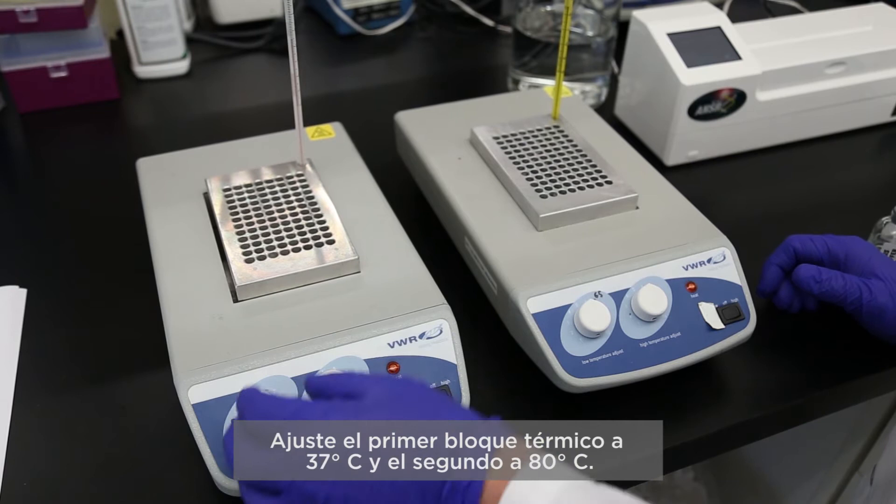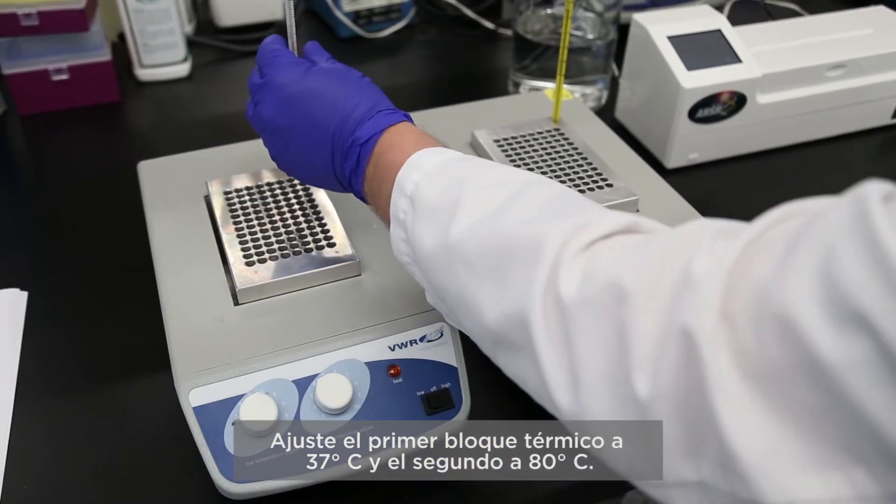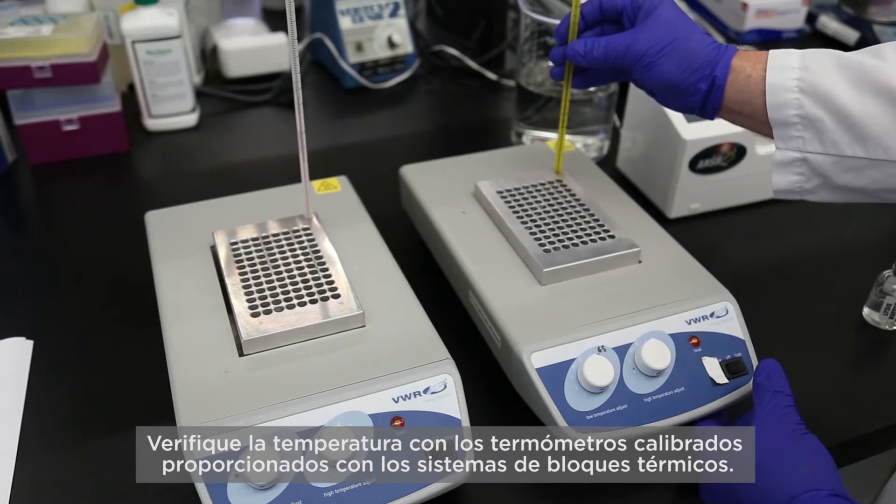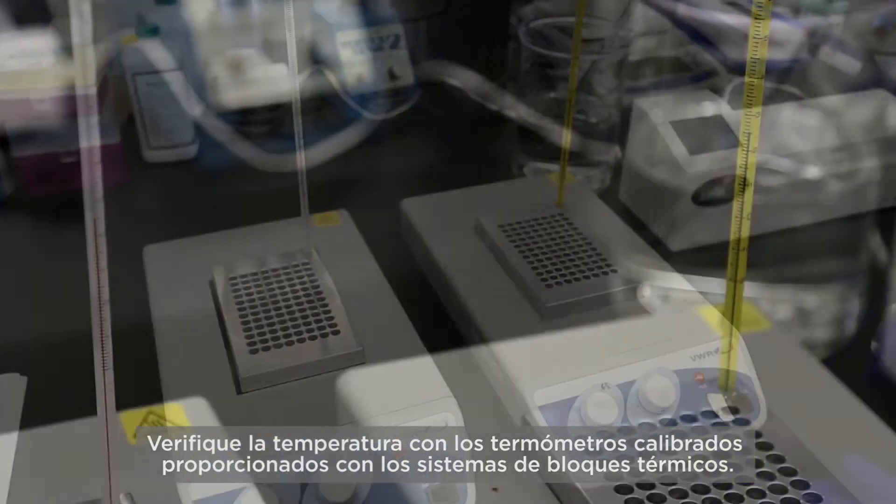Set the first heating block at 37 degrees Celsius and the second at 80 degrees. Verify the temperature with the calibrated thermometers provided with the heat block systems.